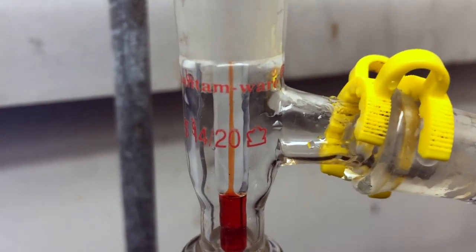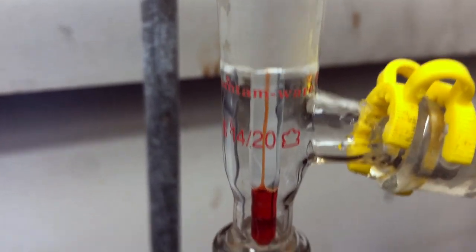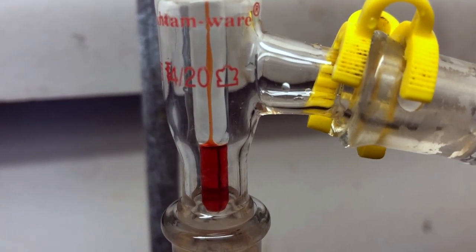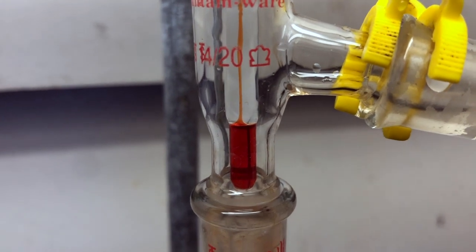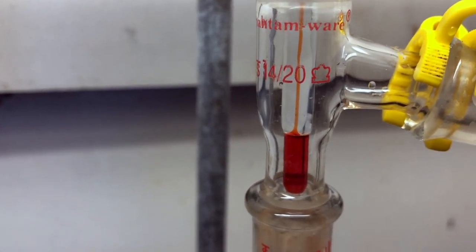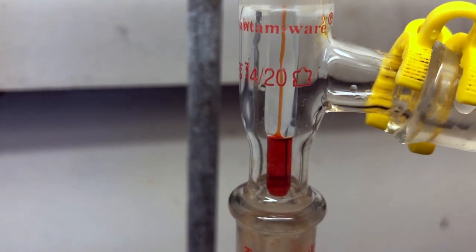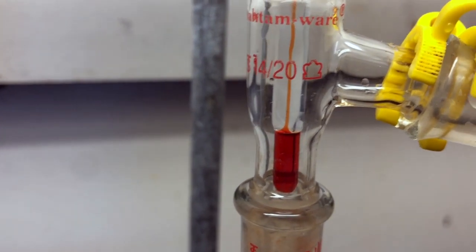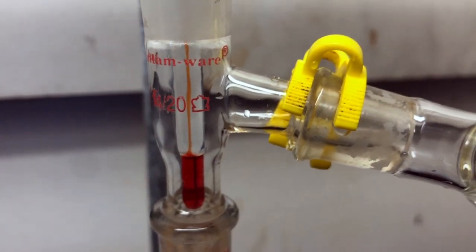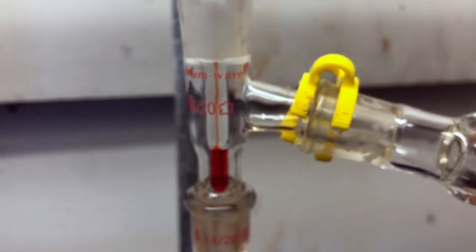We are about to get the first drop going into the condenser — starting to see a few droplets. Notice how much less surface tension the condensing liquid has now compared to what we saw in simple distillation. Much less surface tension, much less viscosity, much less acidity, showing that we have achieved some purification and are effectively removing water during this fractional distillation process.